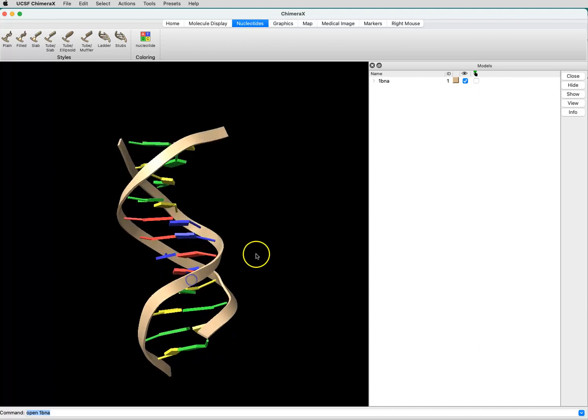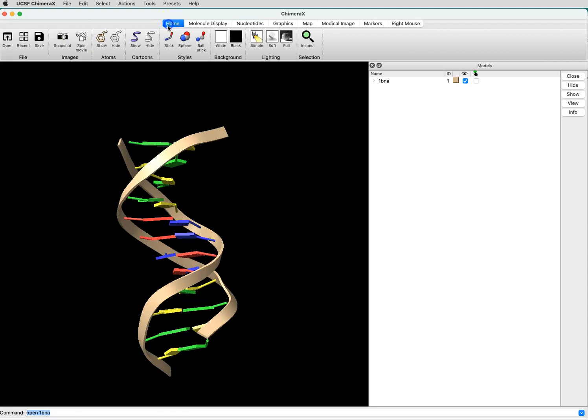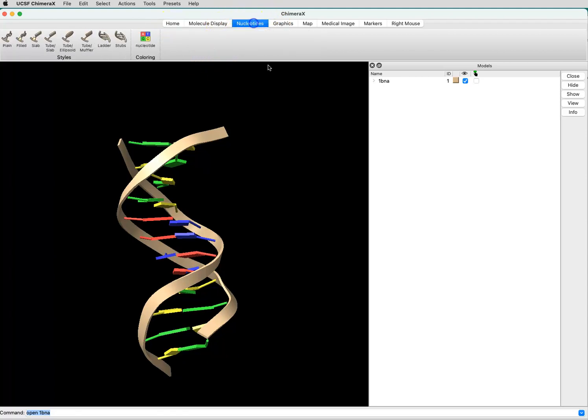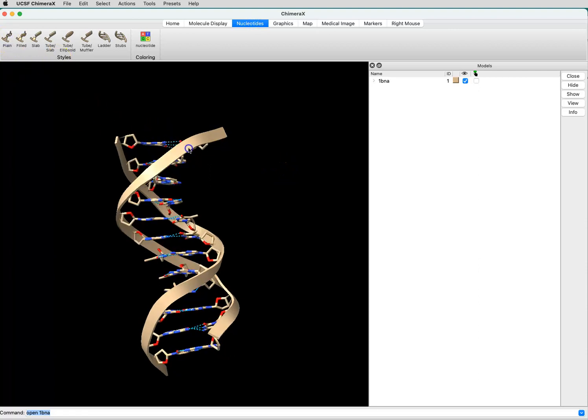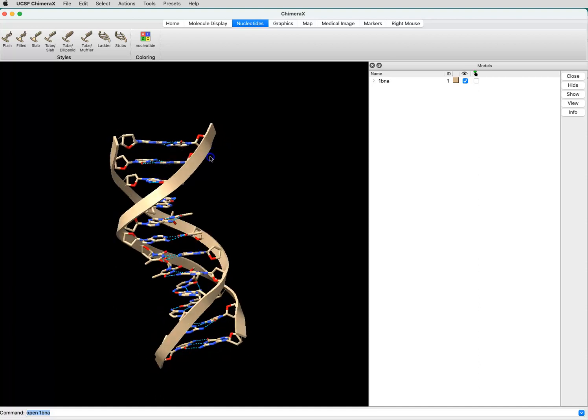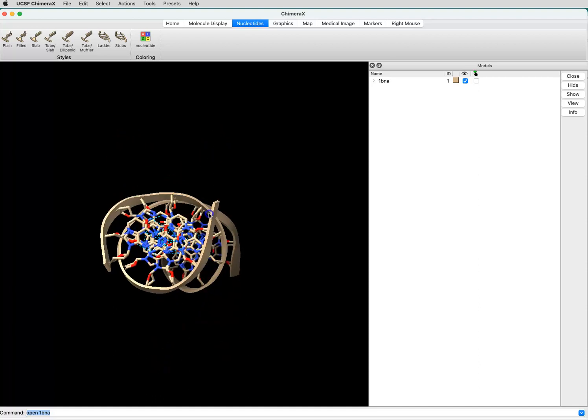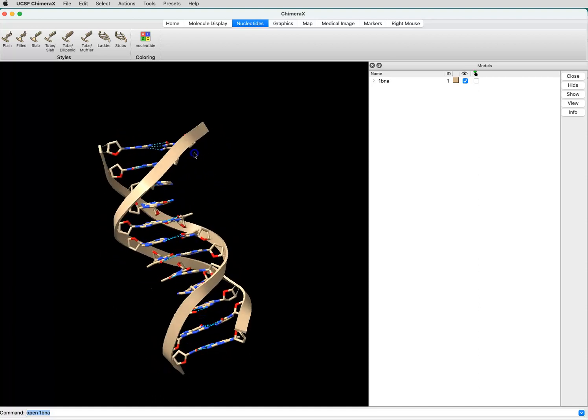The way to do this with nucleotides is to first open the structure, and then you can click on the nucleotides tab here and select Plain, and that will show your atoms of your bases.